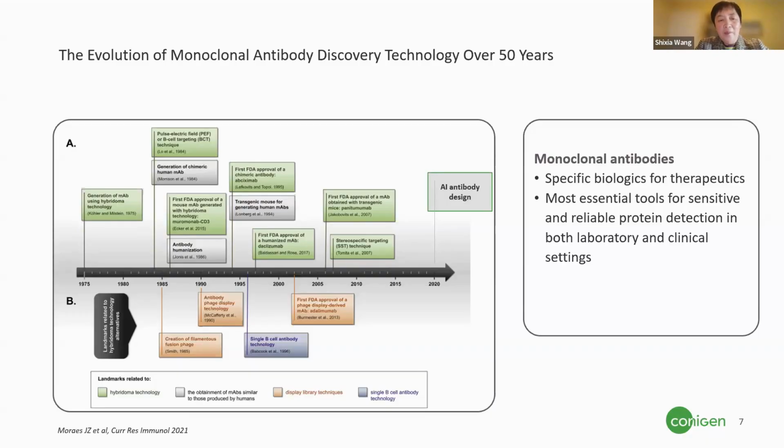Since then, antibodies, especially monoclonal-based therapeutics, have evolved a lot in the last 40 years, including therapeutic antibody forms and antibody discovery technologies.